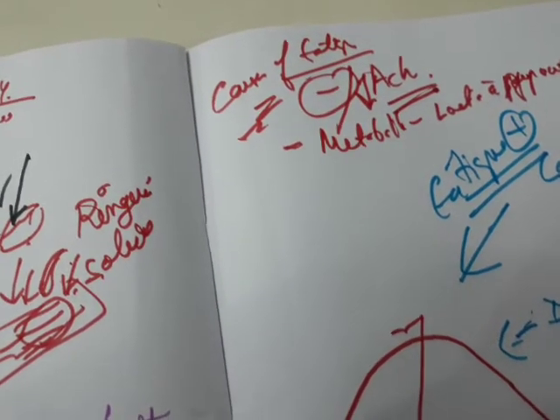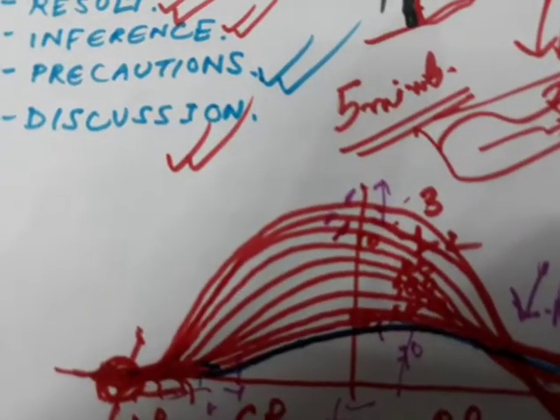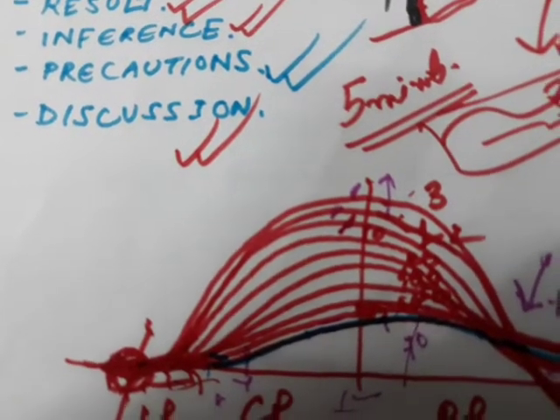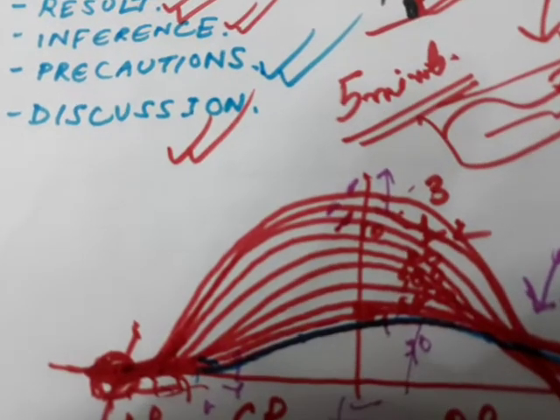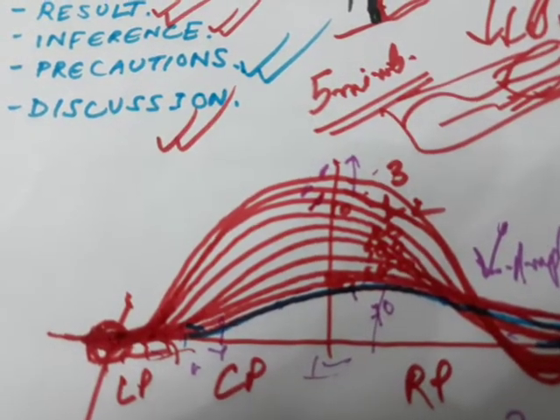Now what is fatigue? Fatigue is a temporary reduction of the working capacity of a cell, an organ, or an organism as a whole, resulting from prolonged exertion. It is a reversible phenomenon and it passes off after rest. Now about this nerve muscle preparation, we can also show that the nerve is not subjected to fatigue by the following experiment.